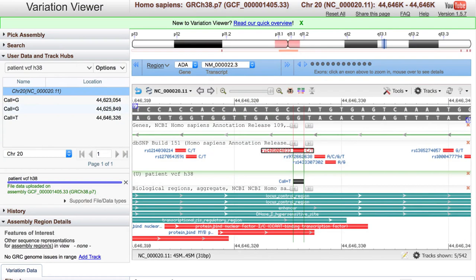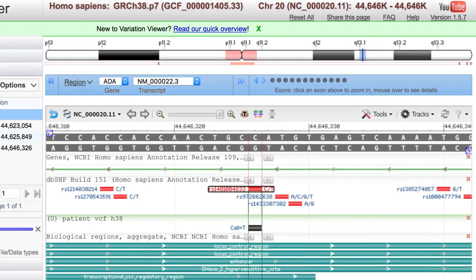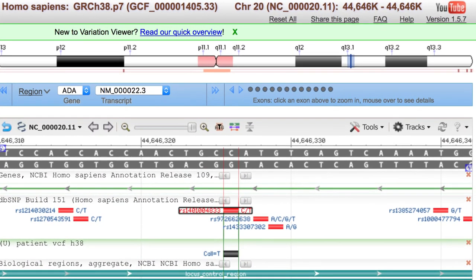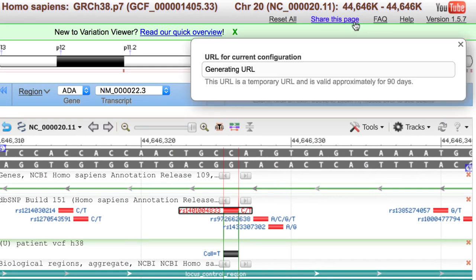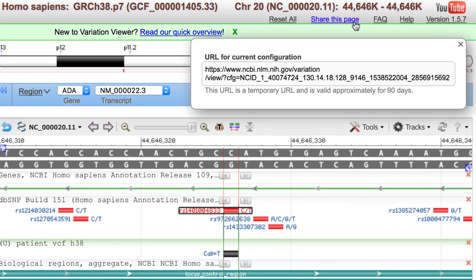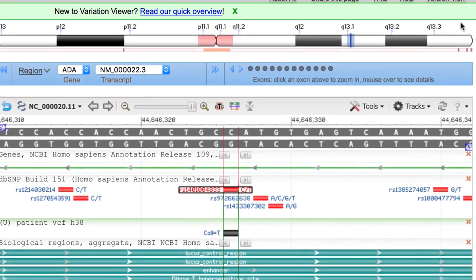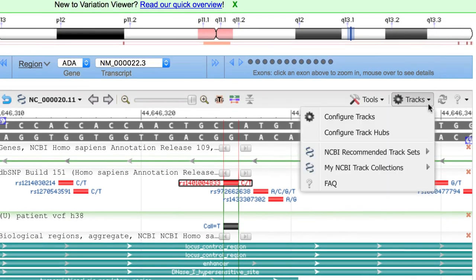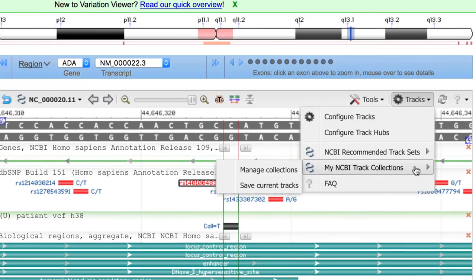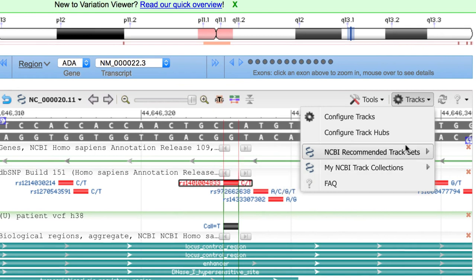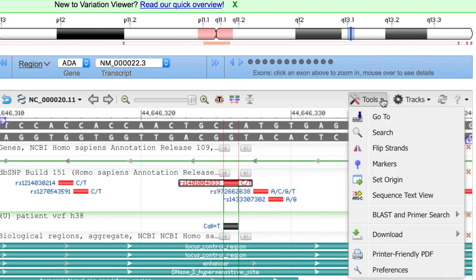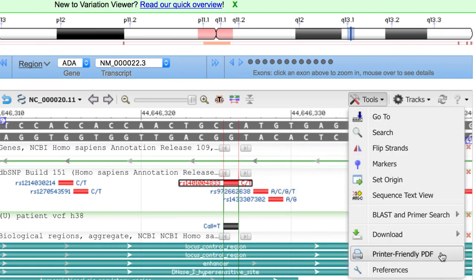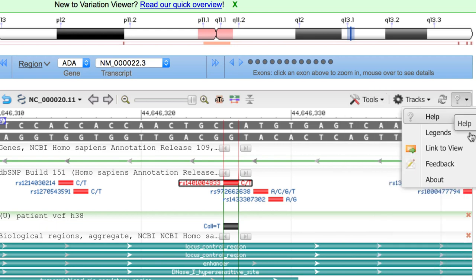That concludes our demonstration in the Variation Viewer. As with other tools at NCBI that incorporate our Sequence Viewer, you can share this configuration with colleagues via this URL, save your own set of tracks via your NCBI account, generate publication quality PDFs here under the Tools link, and send us your feedback, which we highly value.